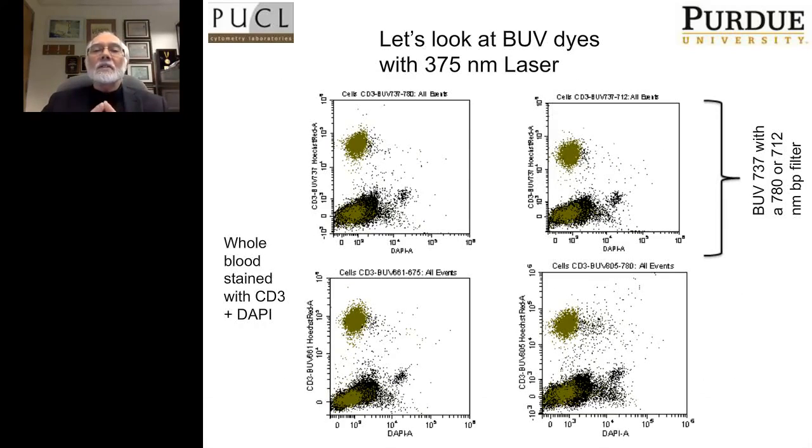So these data, excuse me, are showing the 375 laser exciting DAPI, and I think I have a slide in a moment from Bill Telford.